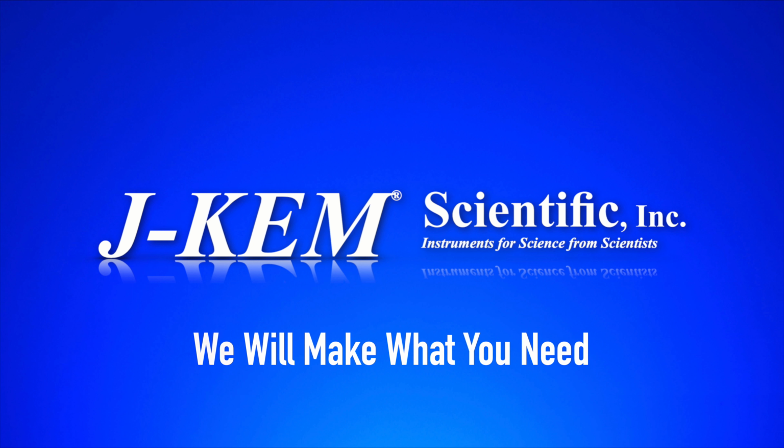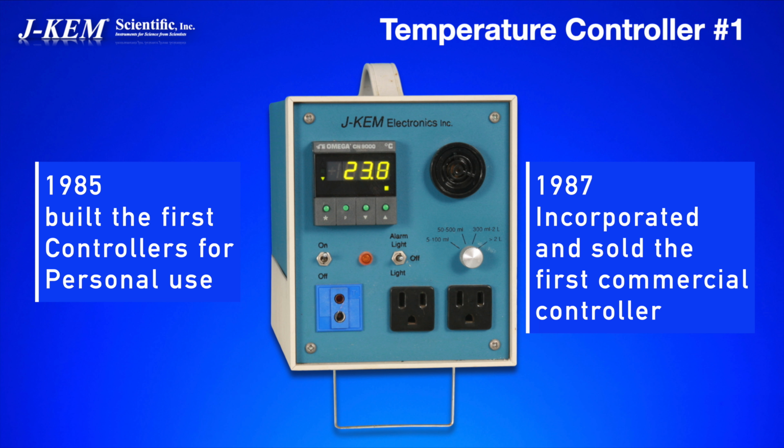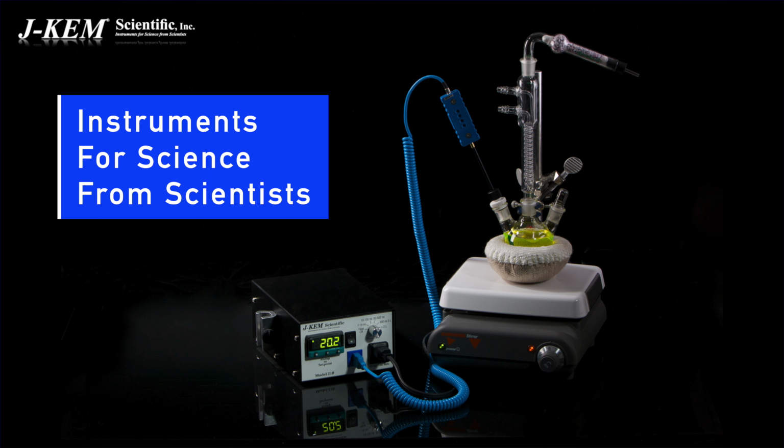I think it's important to understand that J-KEM isn't a company of engineers that make electronics. We are research chemists. Our background is research chemistry. We made controllers so that we could use them in our research. So the logo on our name is Instruments for Science from Scientists. But that's literally true. All of our background is in research chemistry.